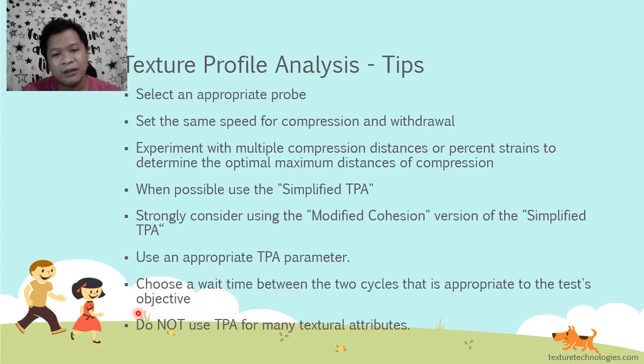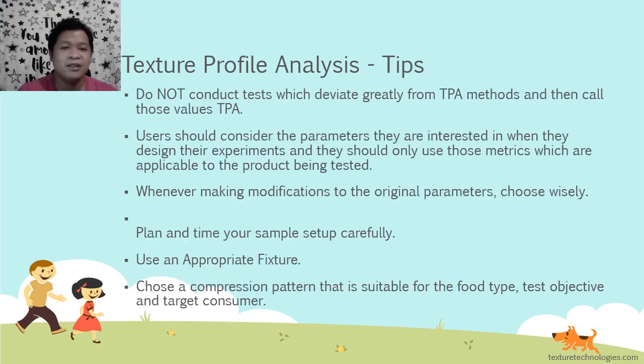And it's not always the case na kailangan mo gamitin yung TPA para sa iba't ibang textural attributes. Sometimes, kailangan mo nga ng hardness kasi yun lang yung applicable. Okay, sometimes yung springiness index yung kukunin mo, and so on. Okay, parang papansin nyo may hugot yung nagsulat nito.